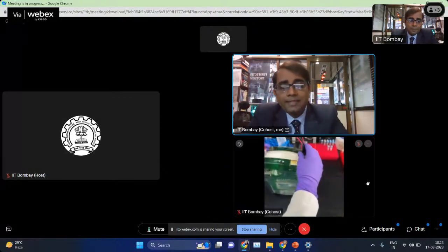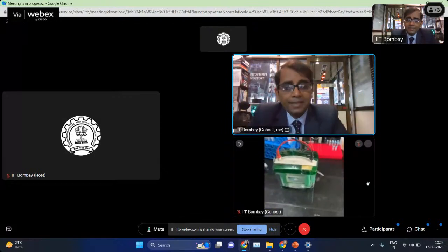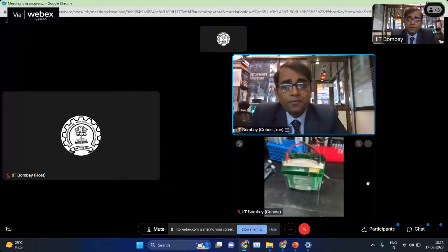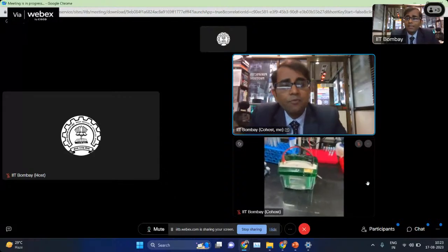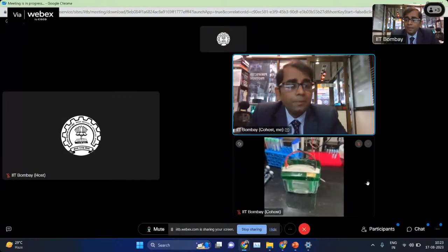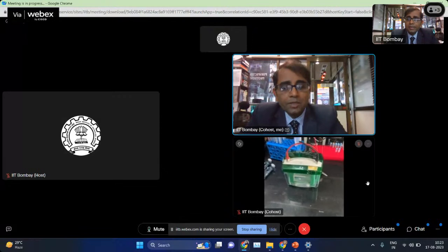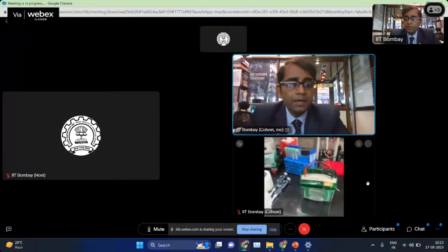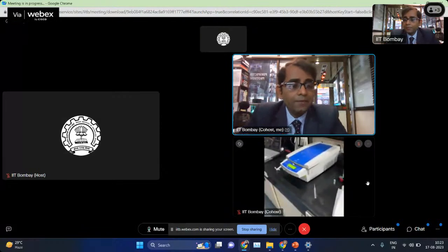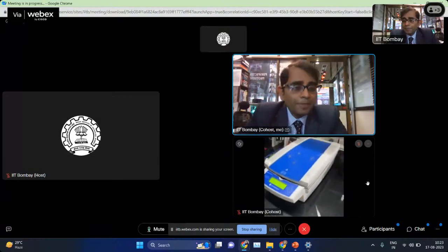If you were to do the dye experiment, where you would have added the Cy3 or Cy5 dyes in the beginning, then after running your second dimension, you will directly scan the gel with the fluorescent scanner, and you will generate multiple images of Cy2, Cy3, Cy5 from those gels. So that is the dye concept. So just again, I think we wanted to refresh you and show you the setup directly from the lab. But today mainly we are going to focus on the sample preparation part.